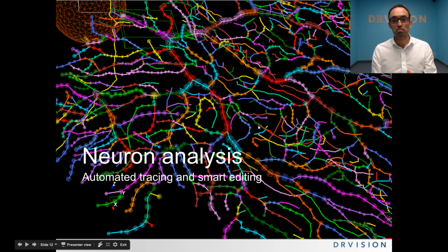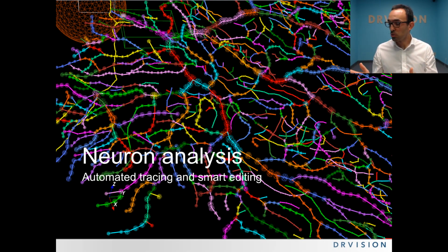So the first part of the actual presentation of Aivia 5 starts here. I'll talk initially about neuron analysis. It's an automated method which we have been working on the last 4 or 5 months. After that, I'll pass over to Bryce, who will introduce the immersive image exploration with the help of Hoyen, who will be doing the demonstration. And then it will come back to me to finish up with the cell classification tool at the very end. And then we'll finish up for today.